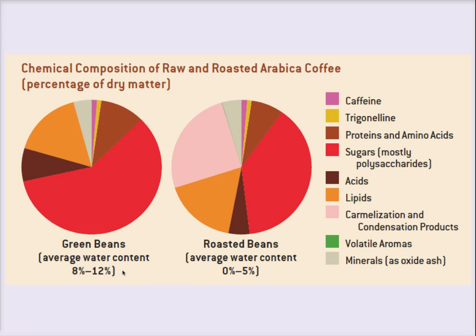But it does show you, here's an industry that has really done a lot to measure the changes of chemical profiles because they can associate quality on a sensorial level with those chemical profiles. And this is an area I think that the herbal industry could do a lot more to develop.